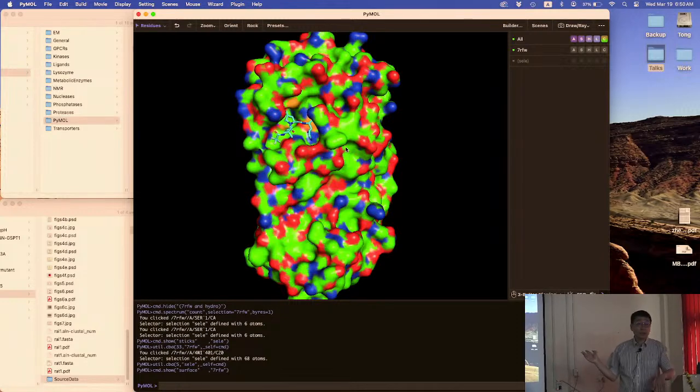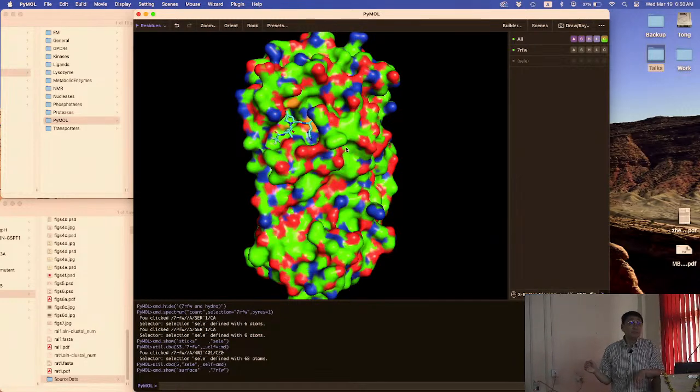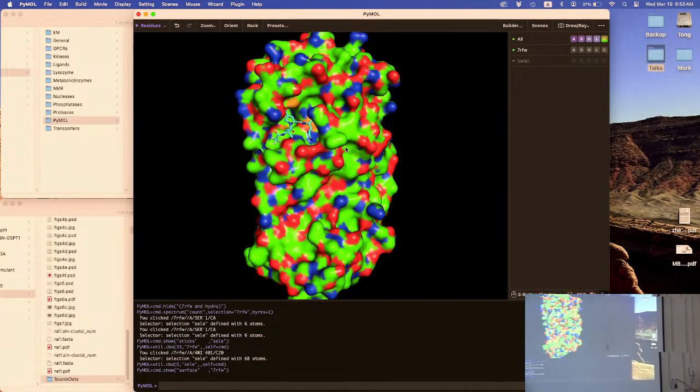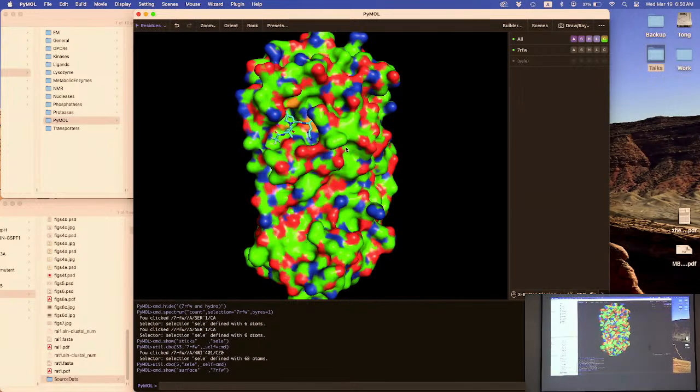You see something like this? Oh, you're still here. So show under show. So under show on this. No, on the other one. Under S, surface. Yeah, scroll down until you find surface.